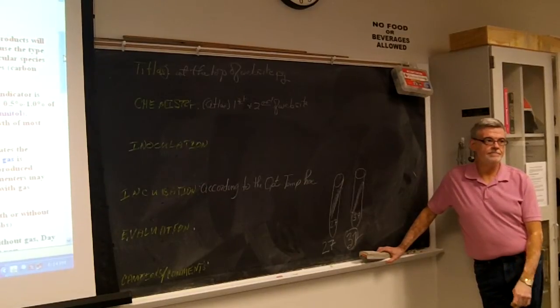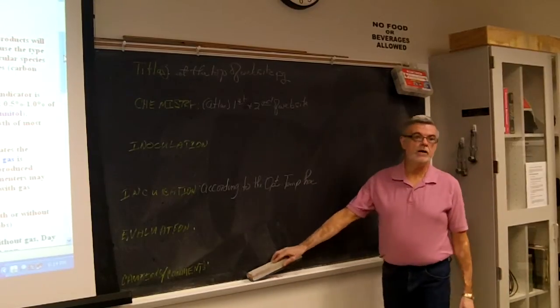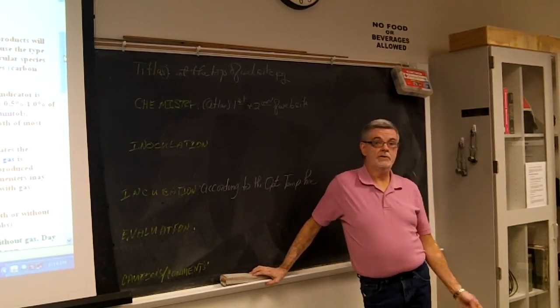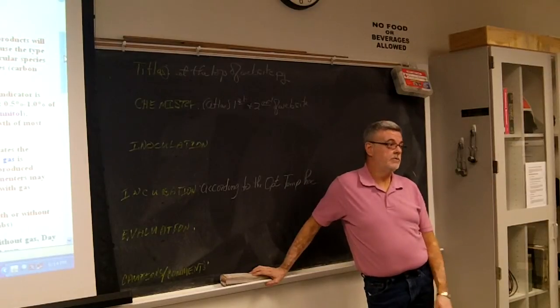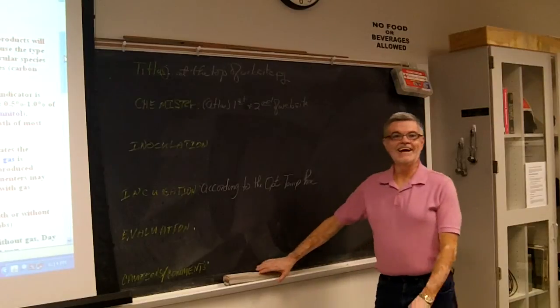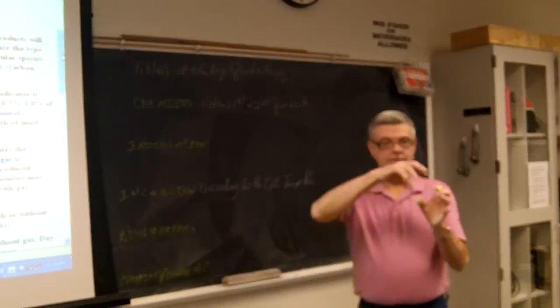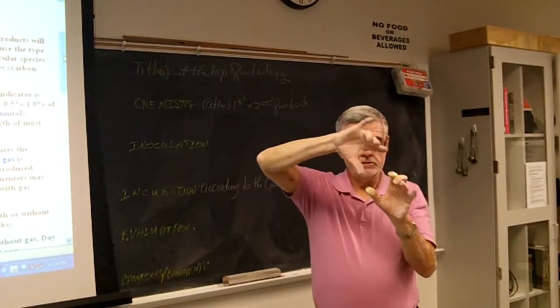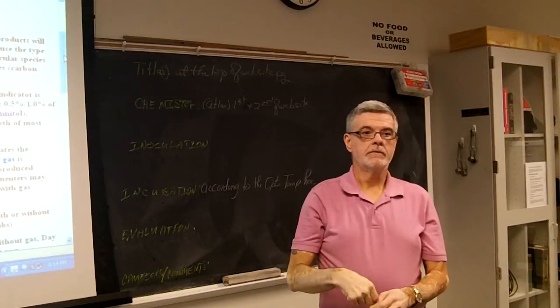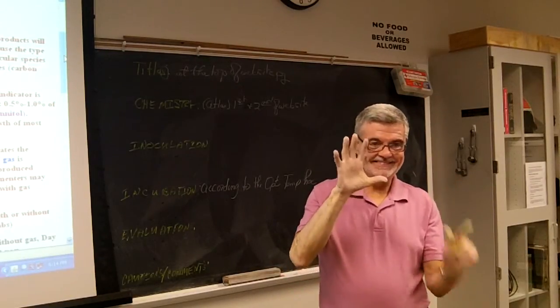All right, so is there anyone that doesn't know how to figure out what temperature to run all your tests at? Anyone confused? I promise I won't make fun much. All right, yeah. So what do you mean by use the biggest? Not the number. The one that spreads across and looks the most profuse by looking at the tube. So what if we can't tell? There's only 27 or 37?